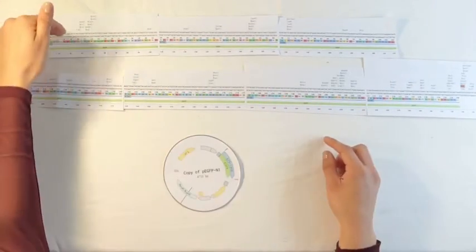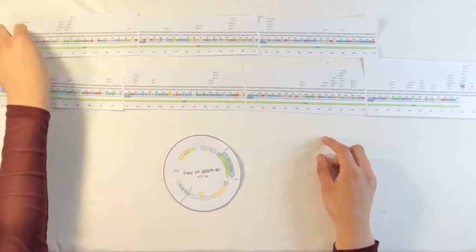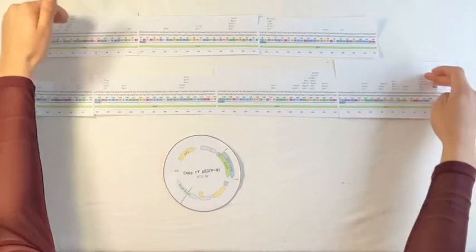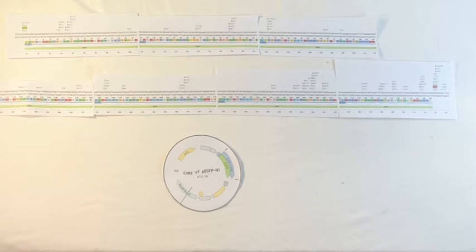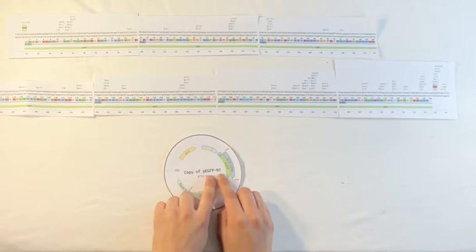We see that on the other side of this segment, and on this side, is the continuous strand of the rest of the pEGFP-N1 plasmid.